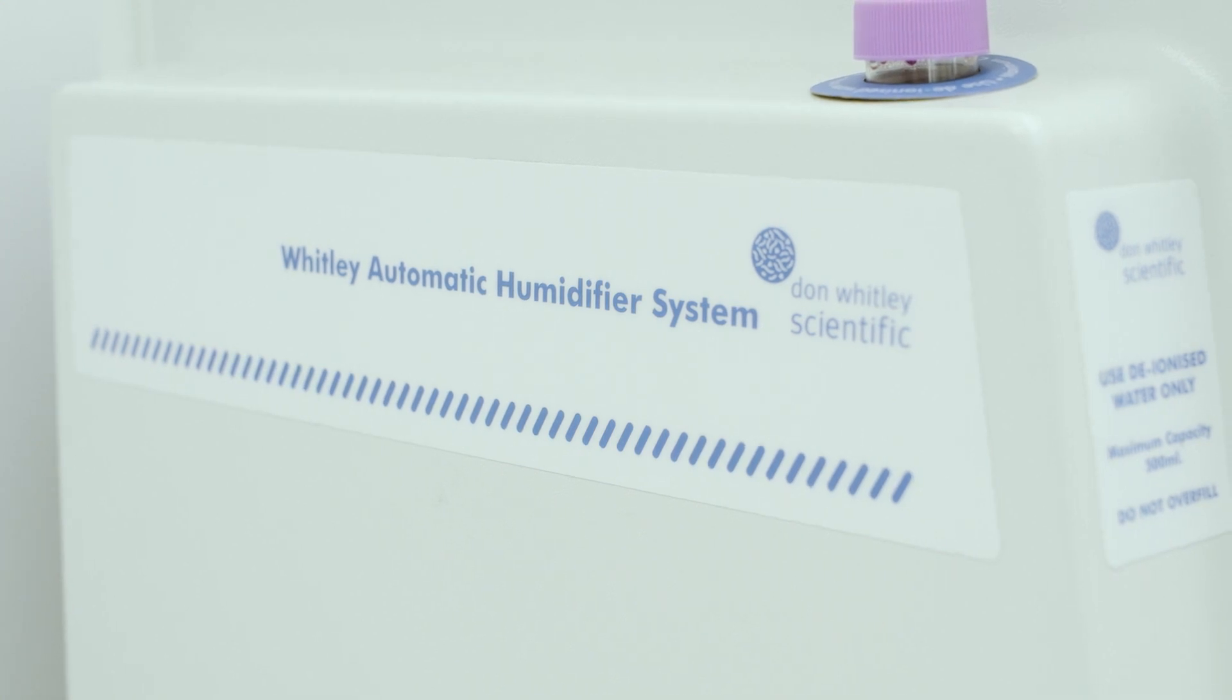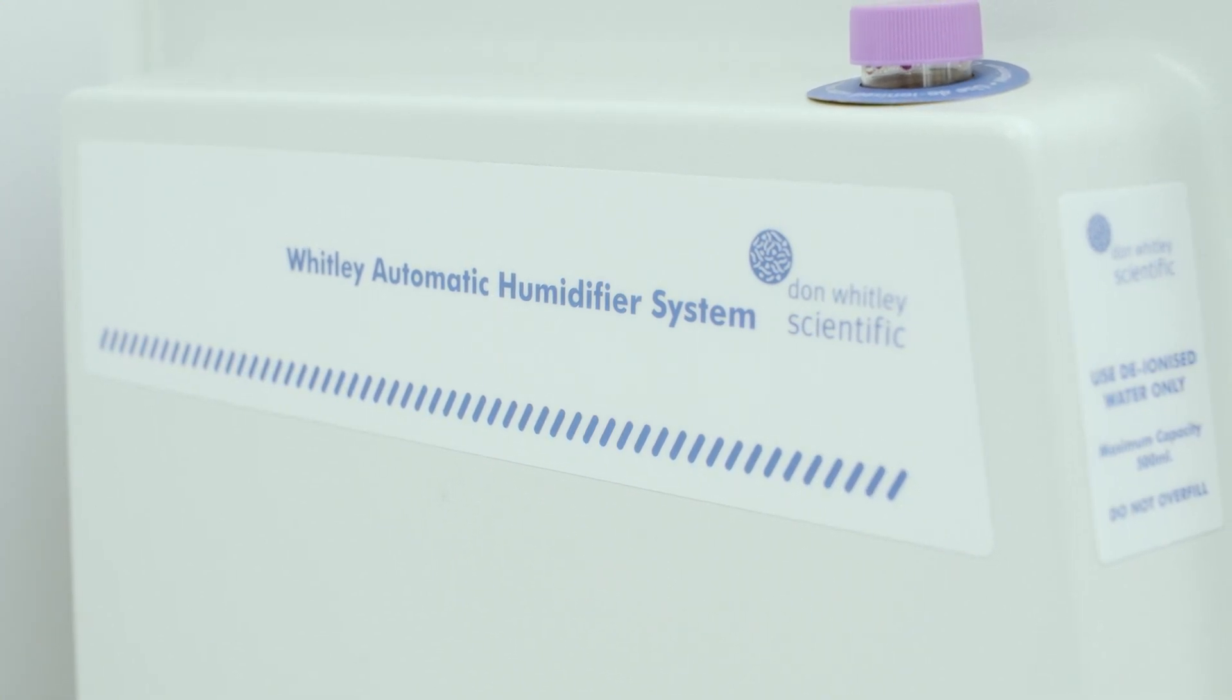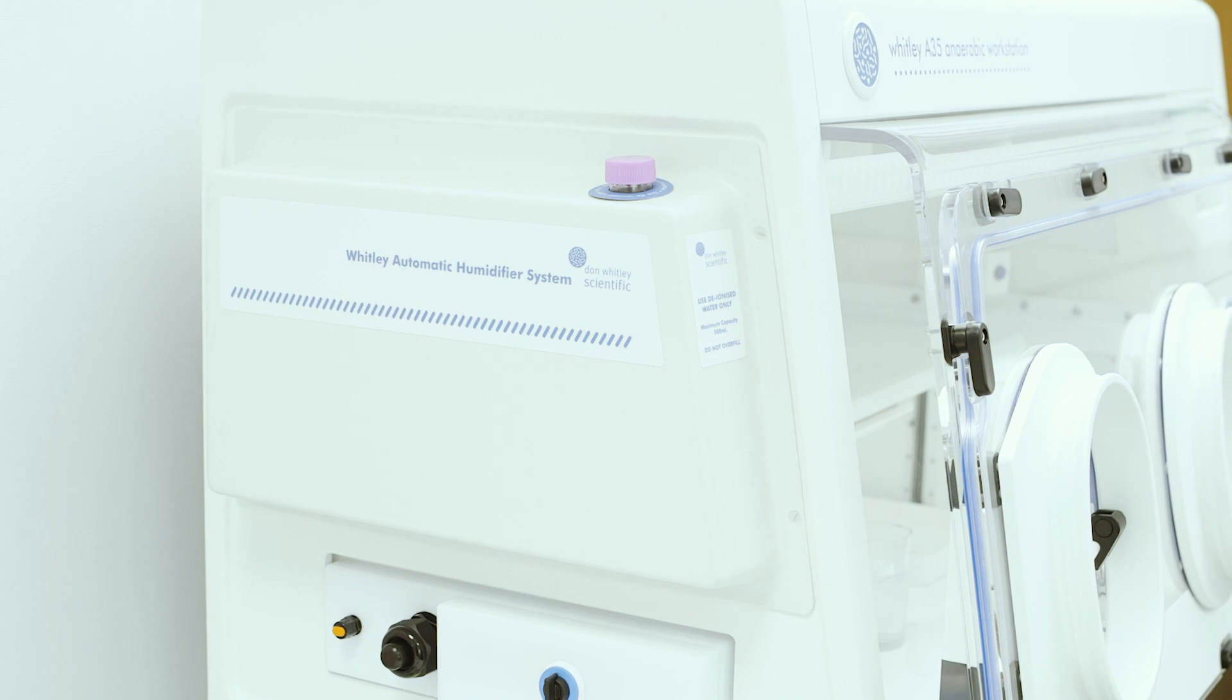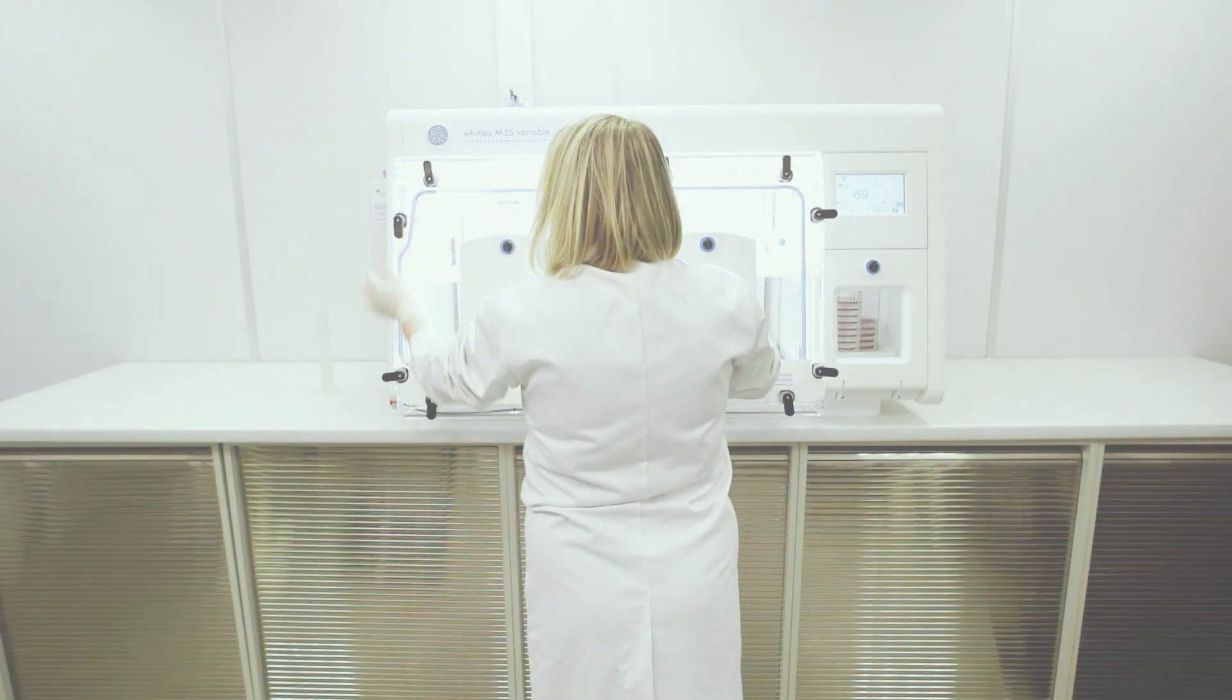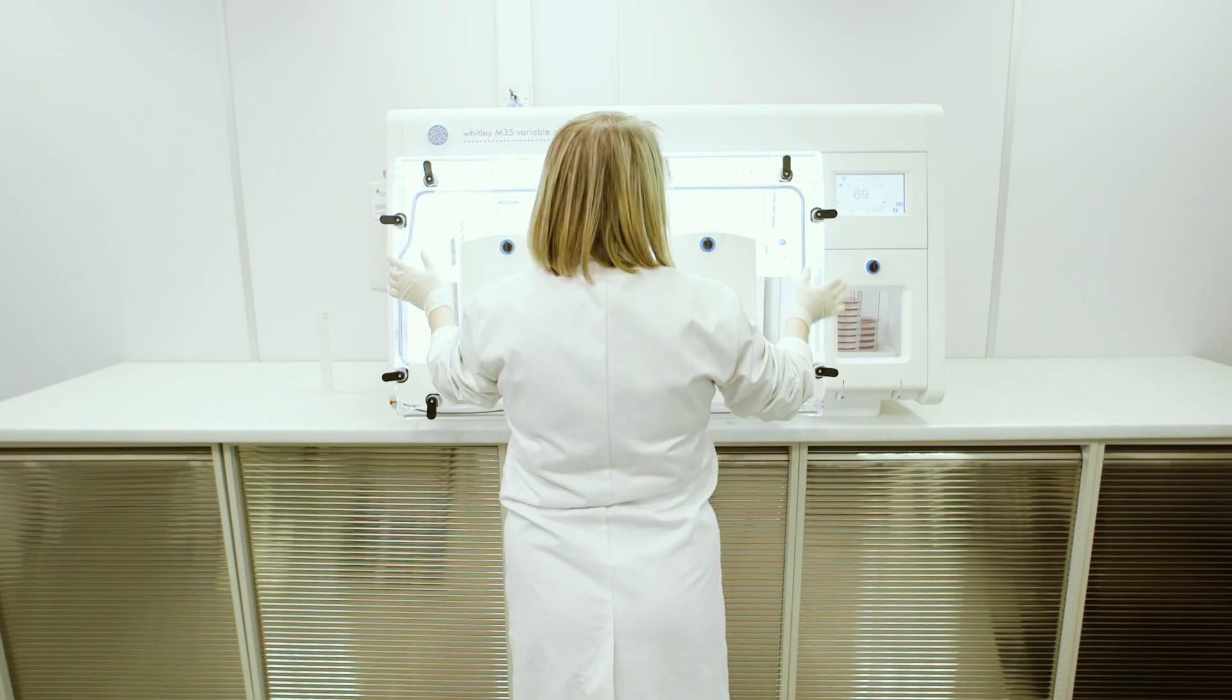As a further option, the Whitley Enhanced Biological Containment System greatly reduces the release of bacteria and other potentially harmful particles from the workstation into the surrounding environment.